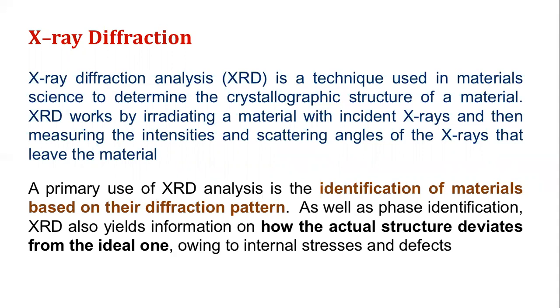X-ray diffraction analysis works by irradiating a material with an incident X-ray, and then by measuring the intensities and scattering angles of the X-rays that leave the material, we can deduce the structure of that particular particle. And the primary objective, or use, of X-ray diffraction analysis is the identification of materials based on the diffraction pattern.